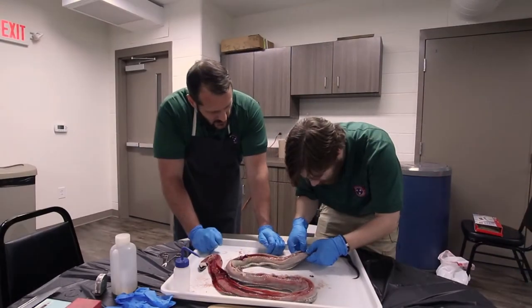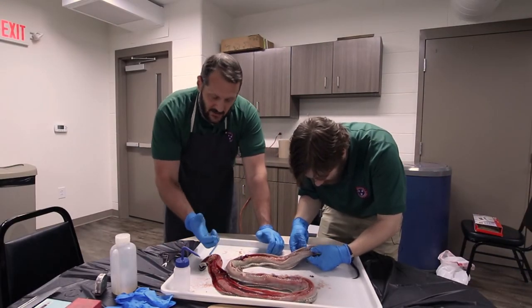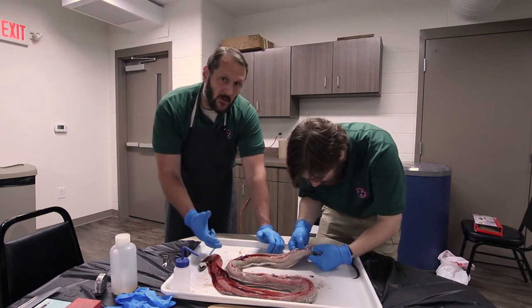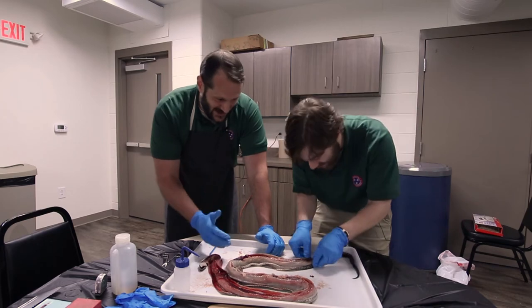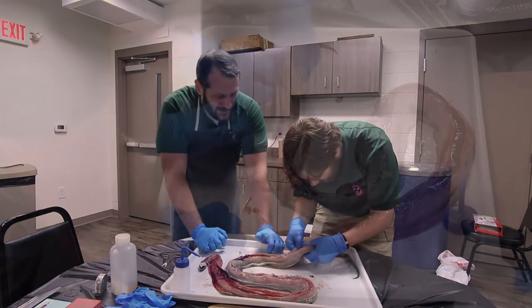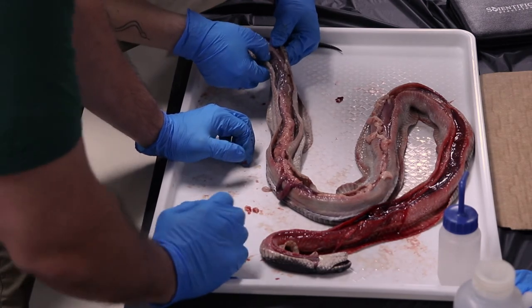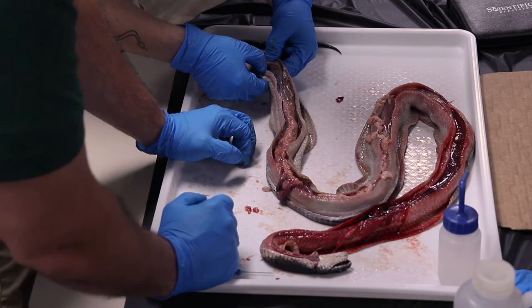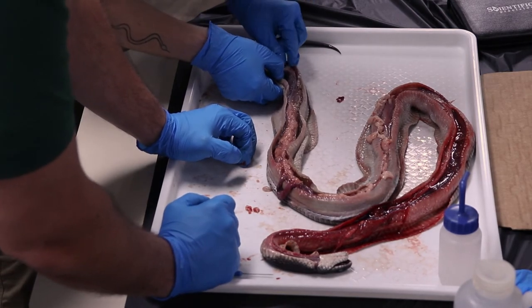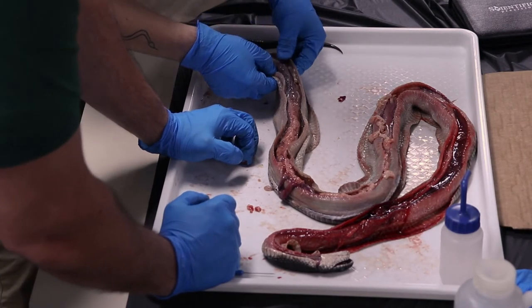Now, another thing, you're the pro at this, Lance, but when I've handled live snakes in the wild, one of the first things that most of them will do is musk you. This one already has. I was gonna say, they have a stinker gland. It's not as strong as skunk spray, but it's a pretty obnoxious smell. And I feel like when you got into this lower abdominal section, we're really starting to get that musk stink. You can see some of it coming out of the cloaca. Is that what that is? Yeah.